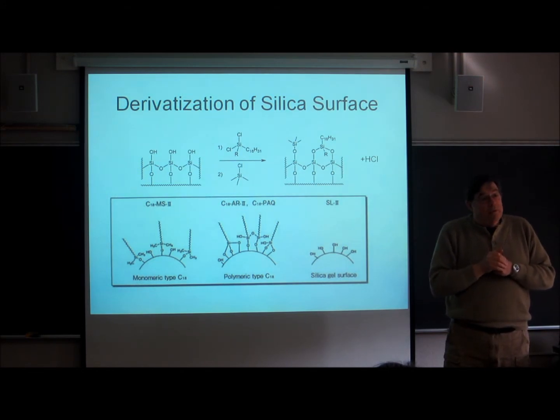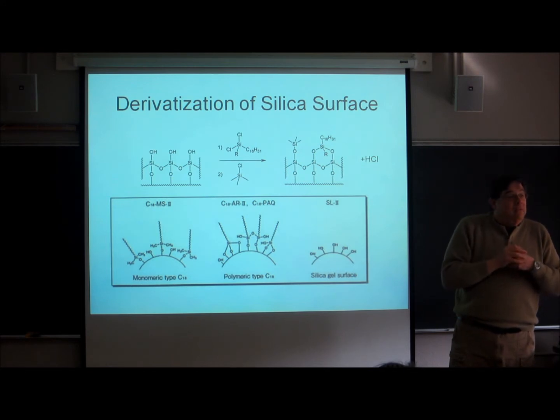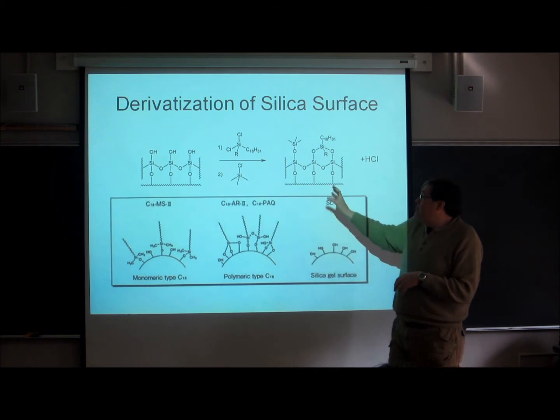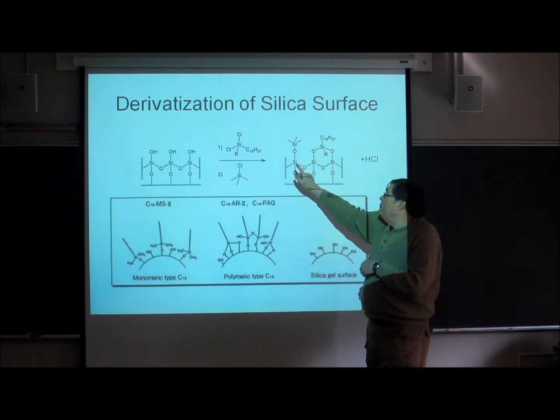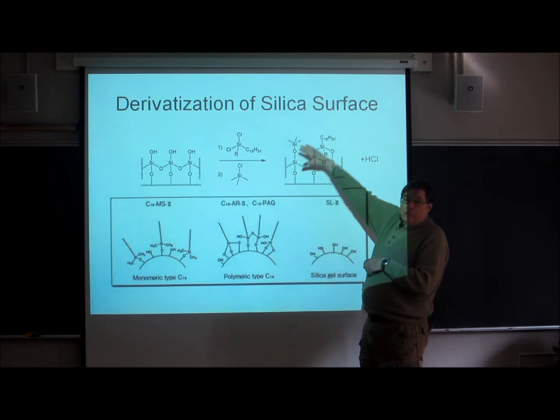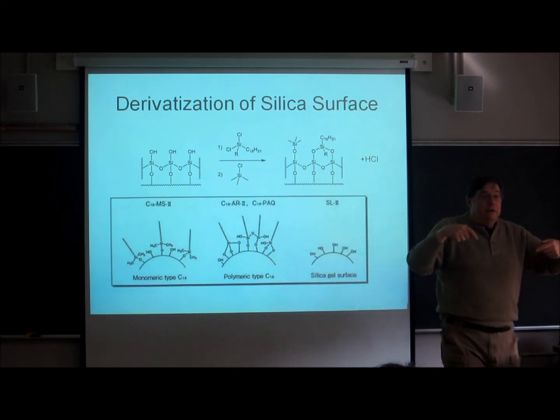And they're very polar. Remember that silica just by itself is what we call a normal phase material. Highly polar, it attracts polar species. What we're trying to do here is to take the silica and use it as a foundation to build a reverse phase surface, an oily phase, on top. We have a lot of these polar groups left behind, however, so that we have oiliness up here, but polarity down here. And so some solutes can come down and interact.